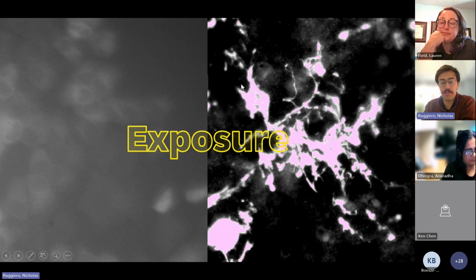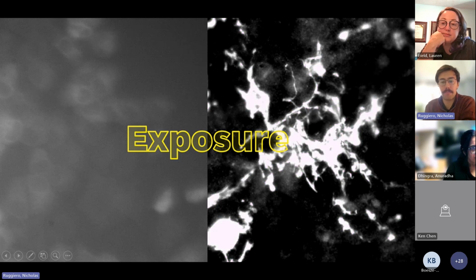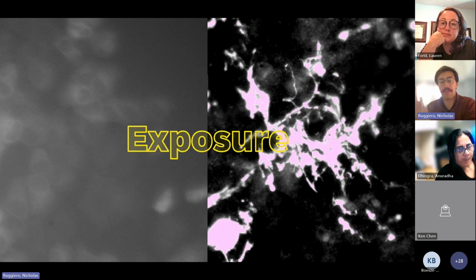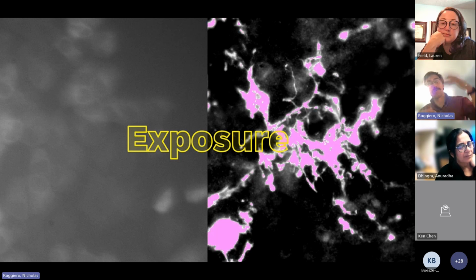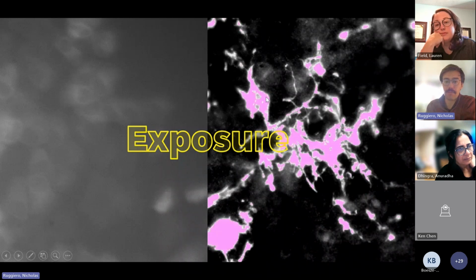Slightly less common is overexposure, but still something that pops up and we have to think about. Everything that's glowing pink here is going to be overexposed, and we're not really going to be able to get good nuanced data out of this. The best way to think of overexposure is if we're climbing a mountain and we have some cloud layer. If our cloud layer is above the top of the mountain, we can always see the entire mountain, how far up we have to go. As that cloud layer starts to get below the peak, we stop being able to see all those details at the top, and we don't know what's going on up there. That's the best way to think about overexposure: we don't actually know the true information here. All we know is that it's very, very bright.